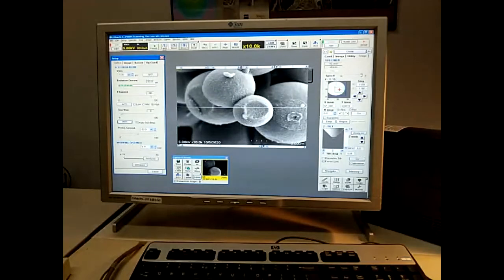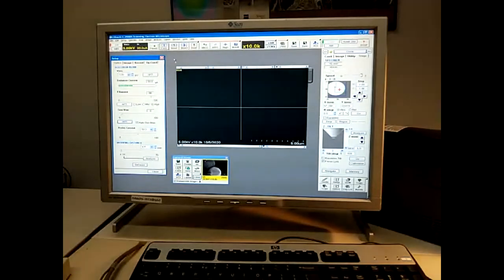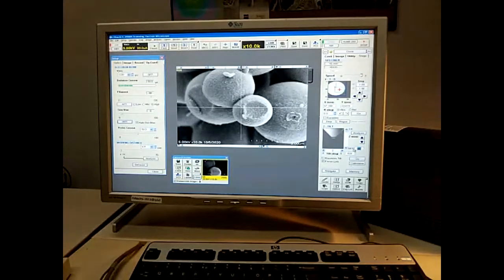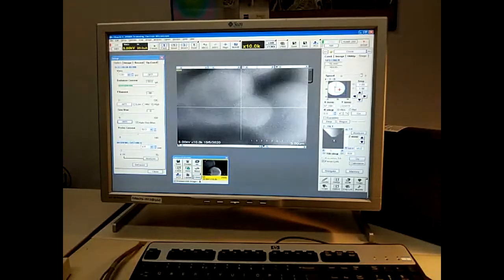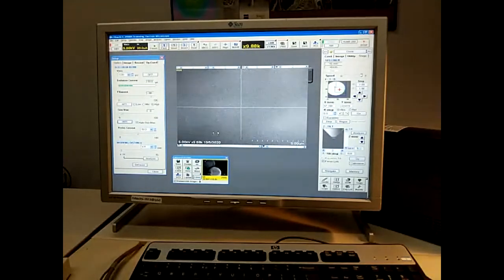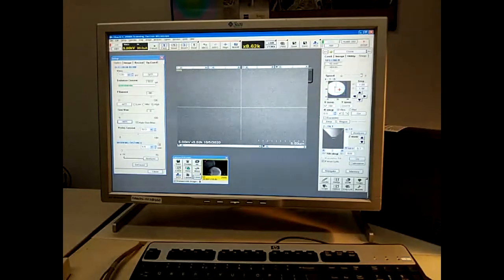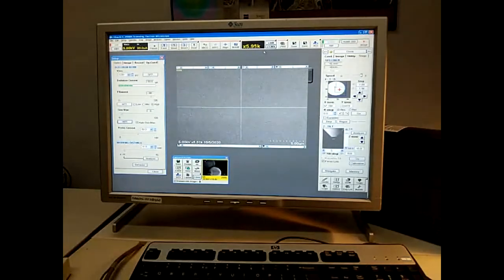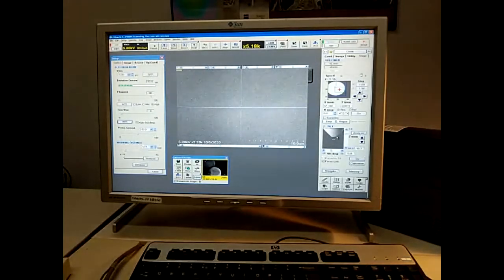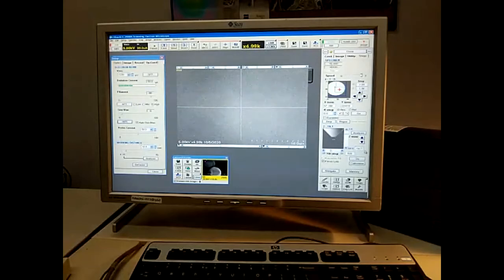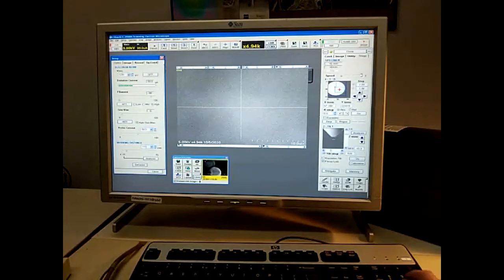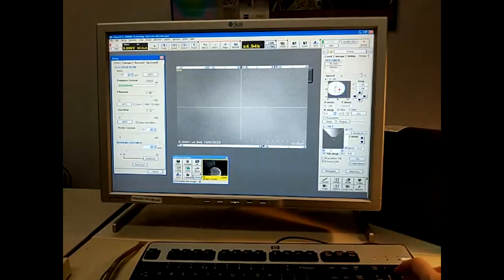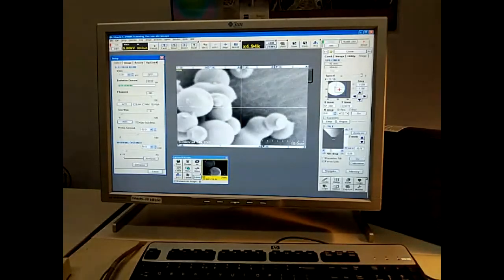If I put that back in fast mode and we move this back out to perhaps 15, give it a minute, turn our magnification down once we get there. You can see the stage movement is displayed on here and you'll see the countdown to the setting that you've established if you type in the working distance to match that.